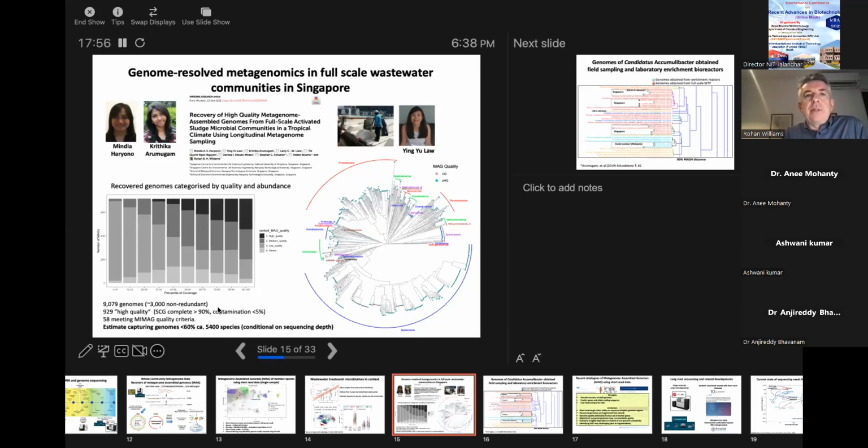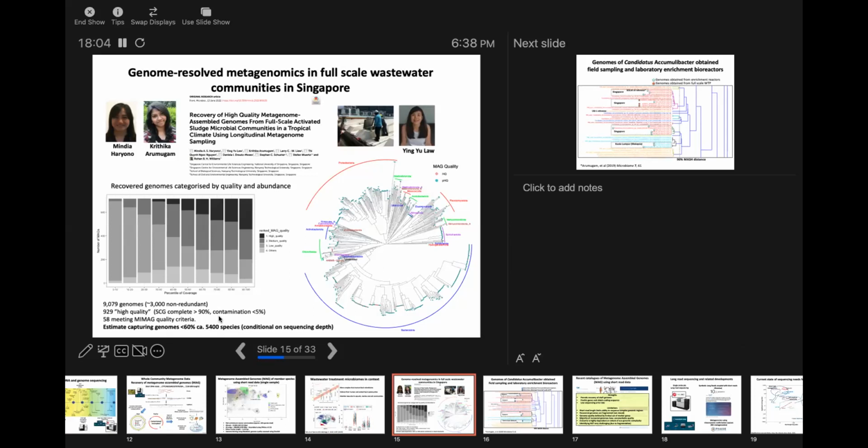And we can do another interesting calculation: if we look at the entire metagenome assembly and just pick off 16S sequences, count the number of them, and remove the redundant sequences, that's some approximation to the number of recoverable species.